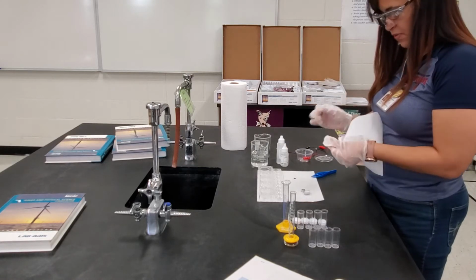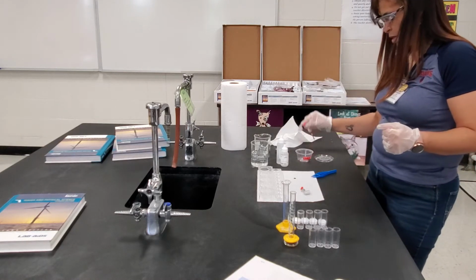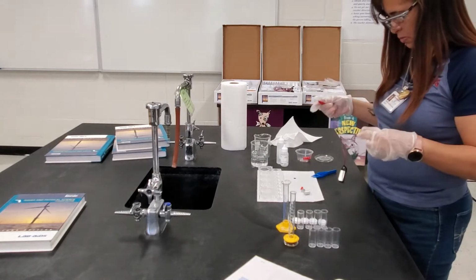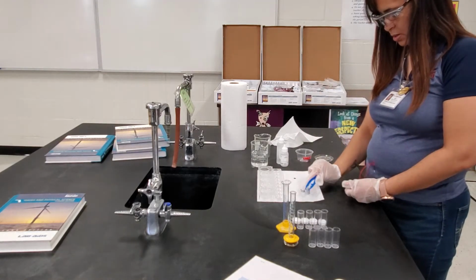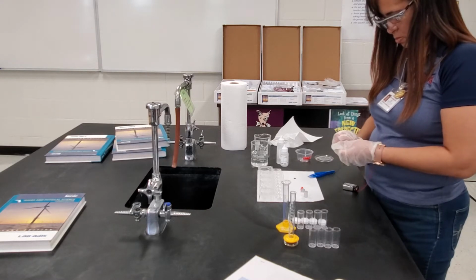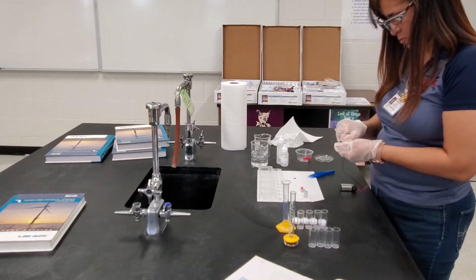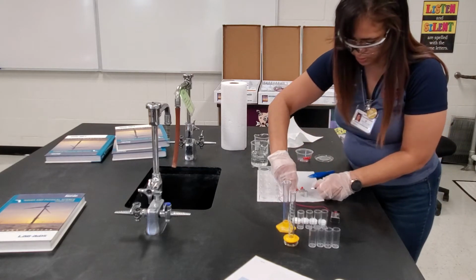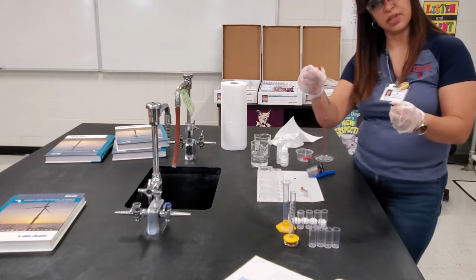So, first test is the electrical conductivity test. I'm going to start with the large, long metal cylinder. Using this with gloves is a little tricky. And we try to do it in such a way that you can see what happened. The light turned on, so the large metal cylinder does conduct electricity.